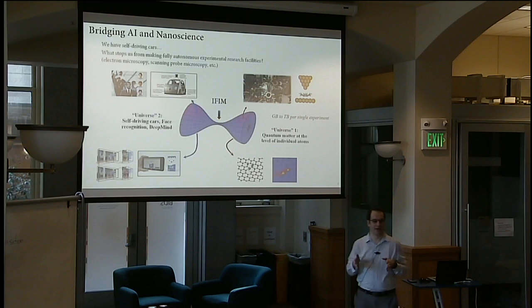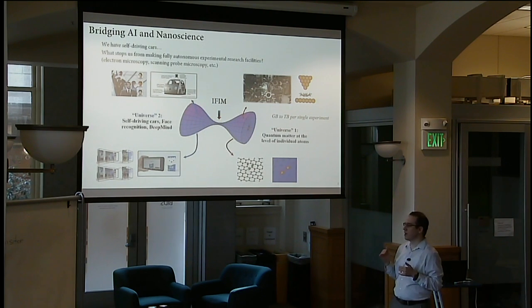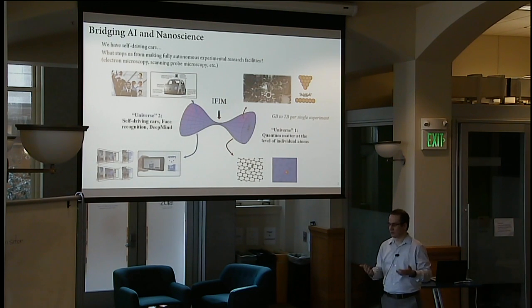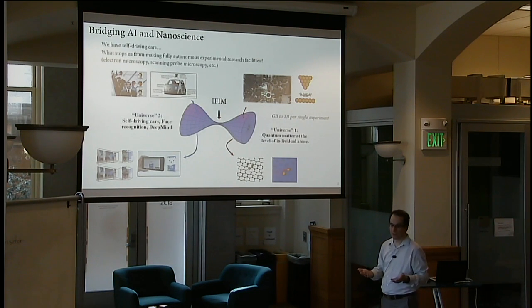But we have a problem here. It's a huge problem. And the problem is that we are getting much more data than we can analyze. Sometimes a single experiment can give you gigabytes to terabytes of data, and you do these experiments on a weekly basis. Using the common tools, the kind of manual analysis that people usually do in this domain, it will probably take you a year to analyze the output of a single experiment. And again, you do those experiments on a weekly basis.